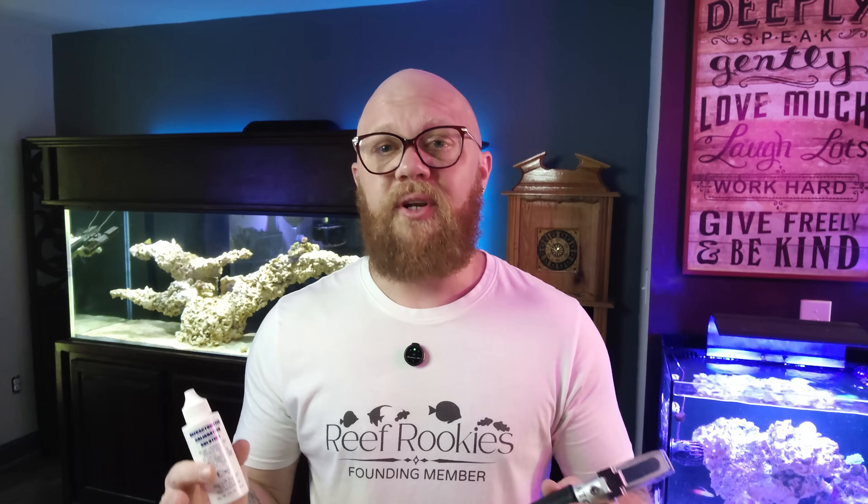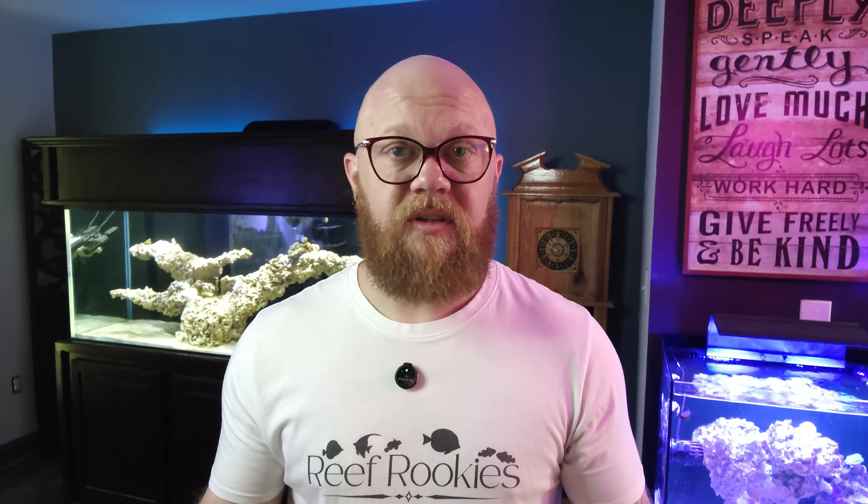Now that we need to properly calibrate our refractometers using either a purchased solution or one made carefully at home, let's go over how you actually calibrate the thing. There are a couple of different types of refractometers. Mine says ATC — automatically temperature correcting — and that does exactly what it says. When you put your calibration solution on the prism, it's going to automatically calibrate for that temperature change and you don't have to try to match temperatures or anything like that.